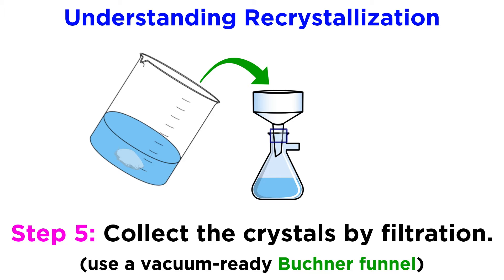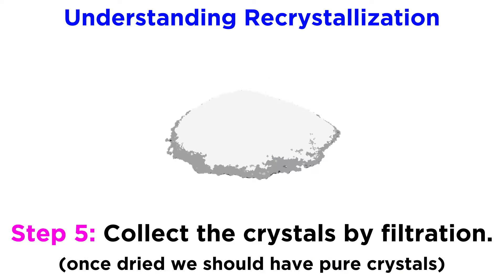Once crystallization is complete, we can use some filter paper on a Buechner funnel and dump the contents of the beaker onto the filter paper. Utilizing a vacuum, the solvent comes through the funnel, and the crystals will sit on top, slowly drying, and after sufficient time, we should have crystals that are nice and dry and pure.